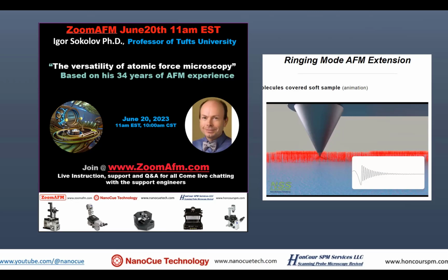Yes, I'm here. Okay. I have a question about the FM-KFM. Do you take the phase signal output to be an input of a second lock-in, or do you take the other signals? I'm a chemist, so those signals always confused me.